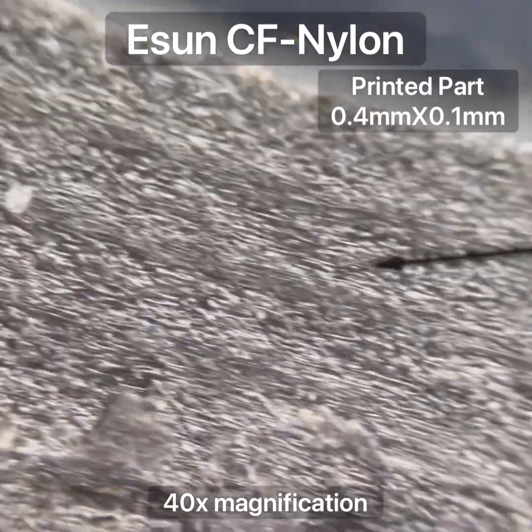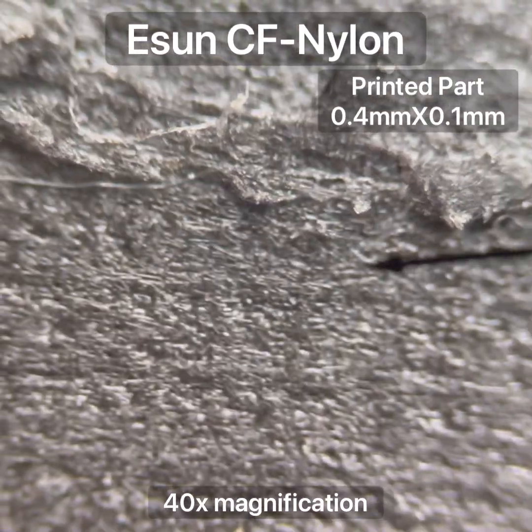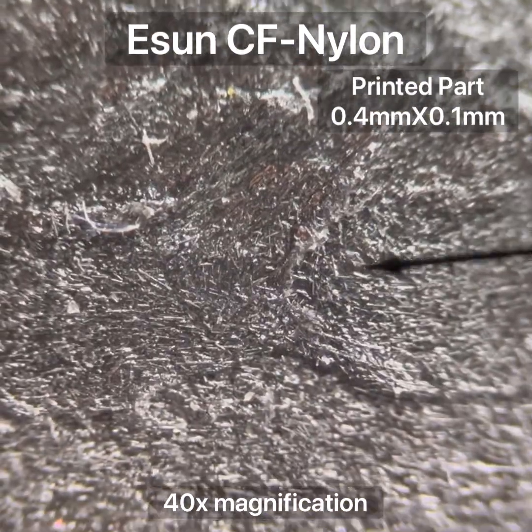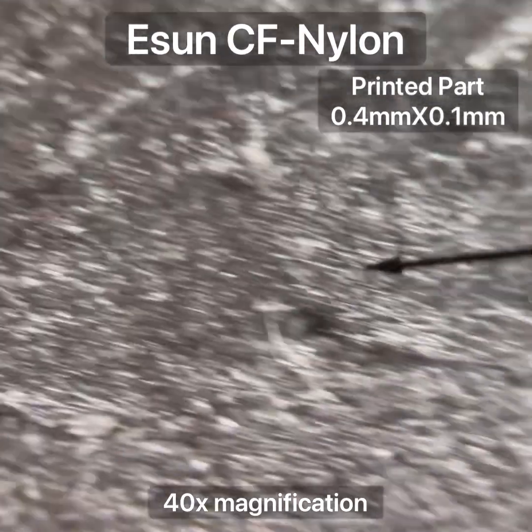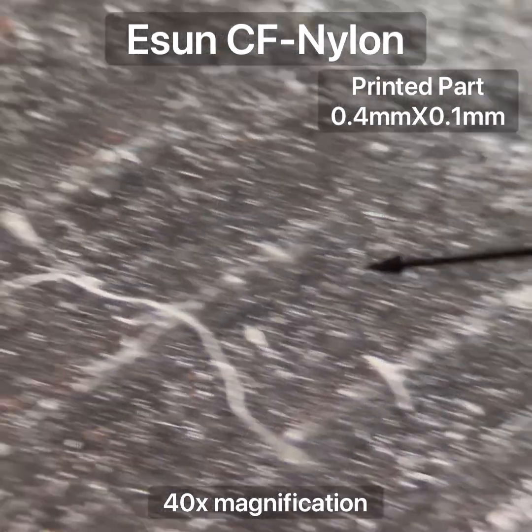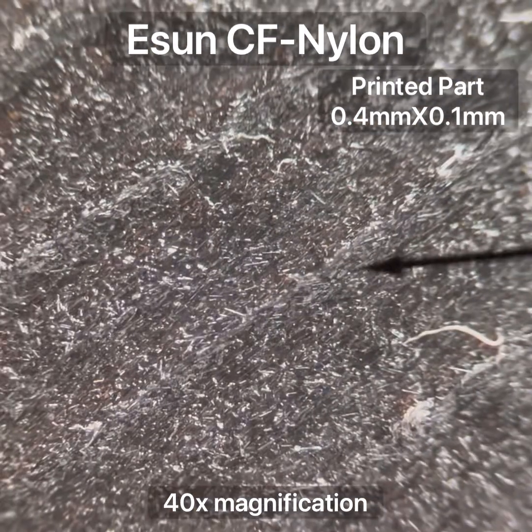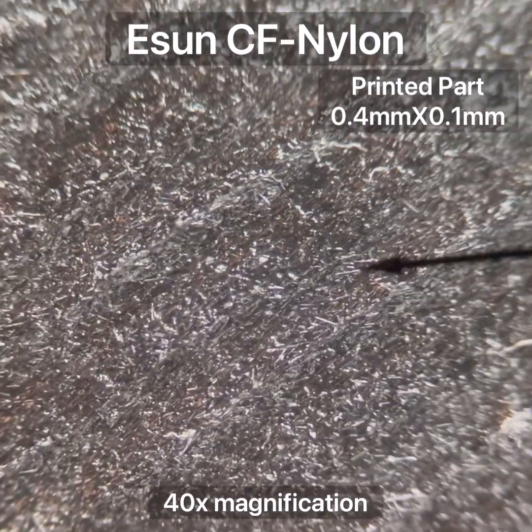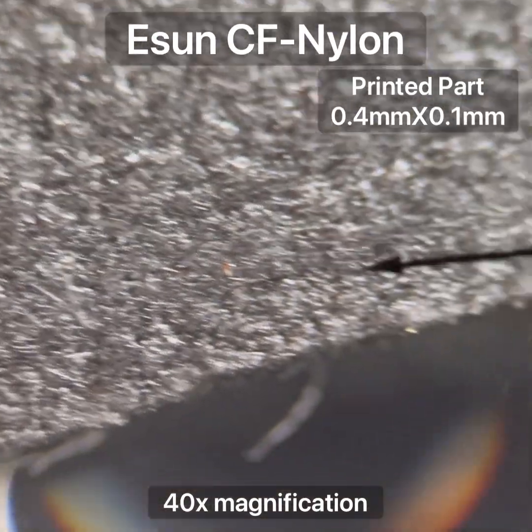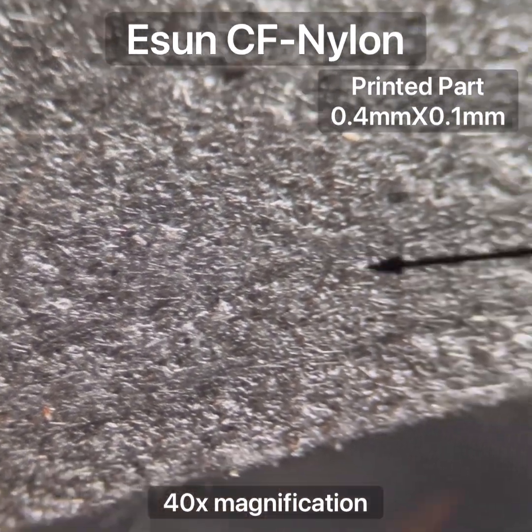So this is an as-printed part from the E-Sun brand carbon fiber nylon filament. You can see that the fibers do remain, for the most part, in the direction of the printing. You can see a little bit of the layer lines there. This is the top surface, so that's each pass, and you can see most of the fibers do line up with the direction of the print. Let's have a look at the edge - this is a perimeter, and you can see that the fibers are lined up with the direction of the perimeter here.